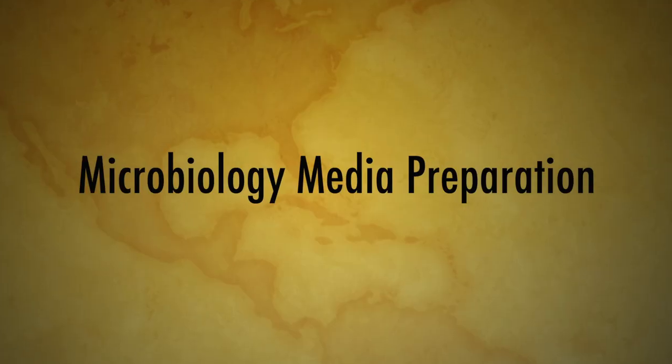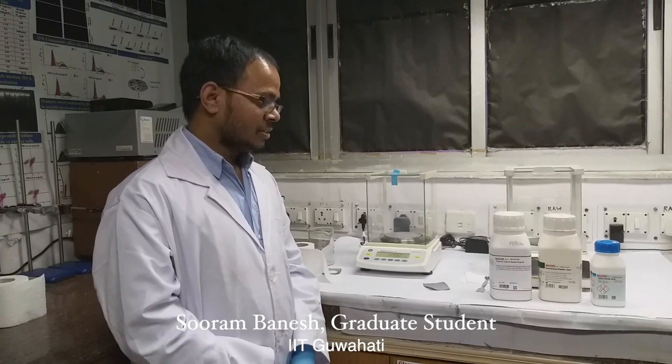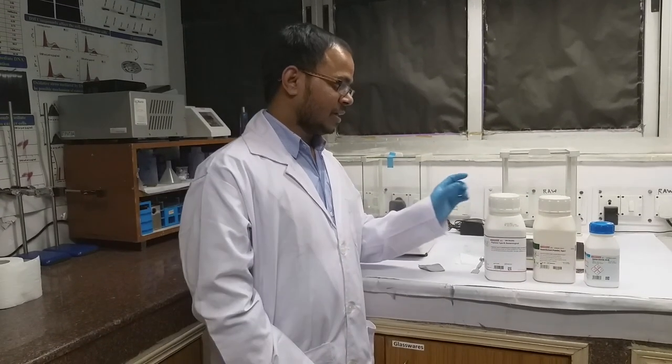We have prepared a small demo clip to explain how you can prepare the microbiology media in the lab, and how you can do the autoclaving and all that. Hello everyone, in this video we are demonstrating how to prepare bacterial culture broth. For preparing culture broth, we need three components.